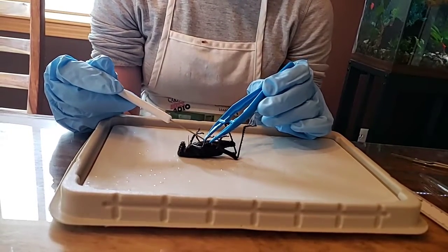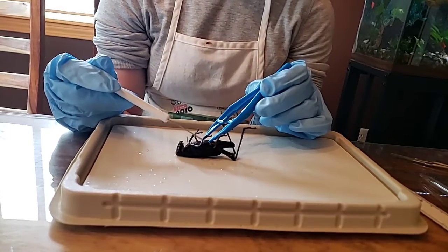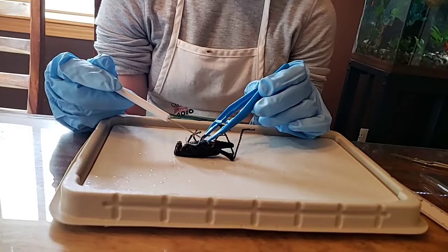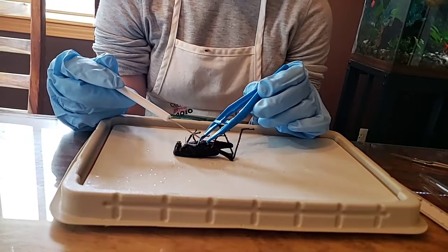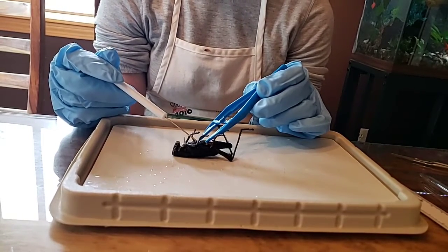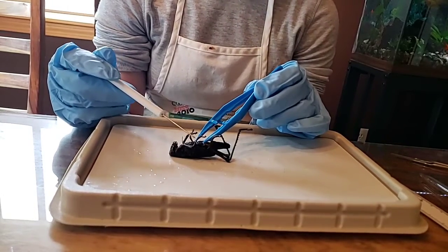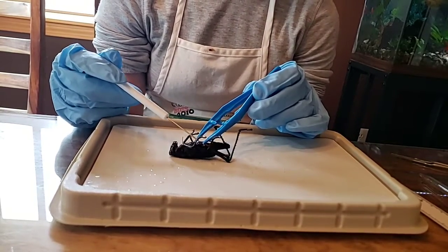All right. So, moving on to number 6. Place the specimen on the dissecting pan, ventral side up. Like this. Very good. It's stomach side up. What side are you going to place it on? Dorsal. On its dorsal side, its back side.